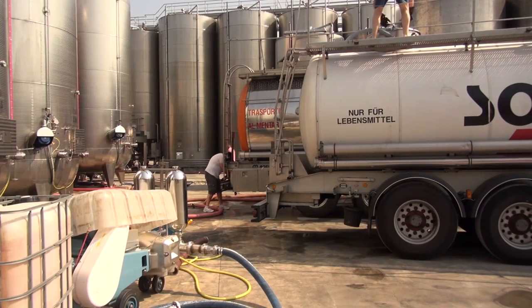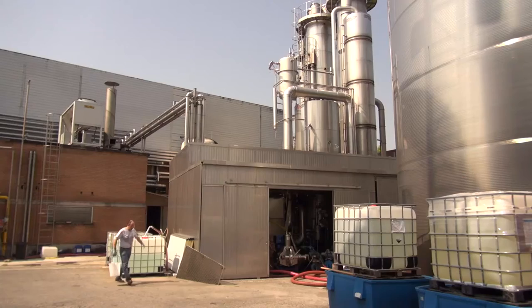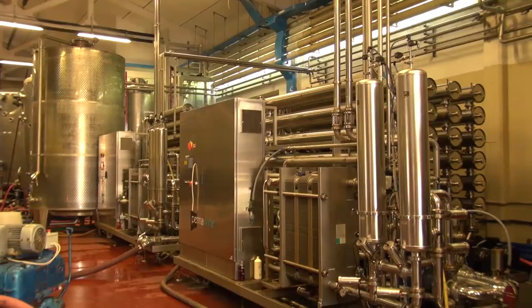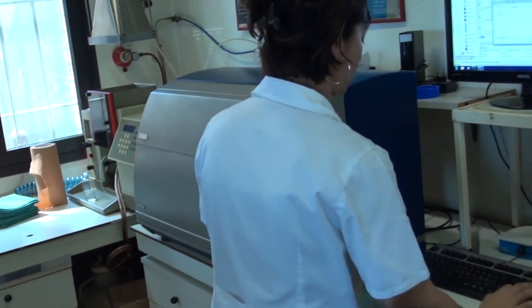From just the raw materials arrival and first checking on the raw material, up to every single step during the processing — filtration step, decantation step, desulfurization, fermentation — and the fermentation usually takes from 10 to 14 days. Every day, twice per day, we perform an analysis to check all the parameters. It's not a problem on one single analysis on one parameter — it's that you can just see the whole picture in a very fast way and understand all the issues.